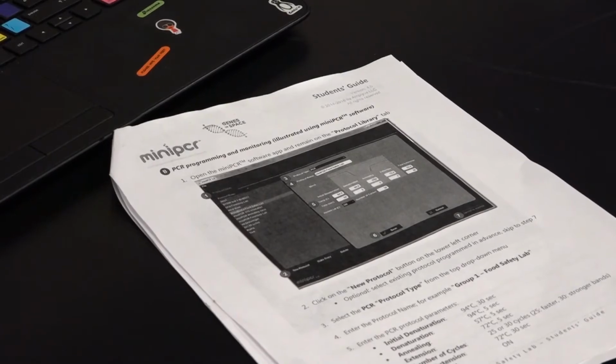Perhaps an analogy would be better for me. Imagine taking a book that's 400 pages, right? But I'm only interested in pages 4 and 12, right? I don't want to make a copy of the entire book over and over and over again just to get more copies of 4 and more copies of 12, right? But if I can find a way to just make a bunch of copies of 4 and just make a bunch of copies of 12 and make that very rapidly, like on a Xerox machine, that would be far more beneficial, because that's really all I'm interested in rather than an entire book.